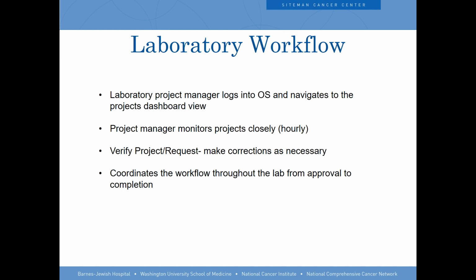So the specimens you can see on this page, but you can also query for a request, and it'll list the specimens that way. Right. So yes, the reporting module is integrated with the project tracker, so you can generate lots of interesting reports, either raw data reports or even count-based reports, like per project, how many specimens were released, or processed, etc. There are a couple of non-project tracker questions. I'll come to that later.